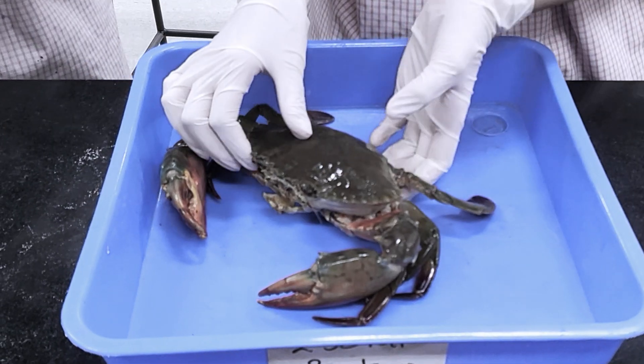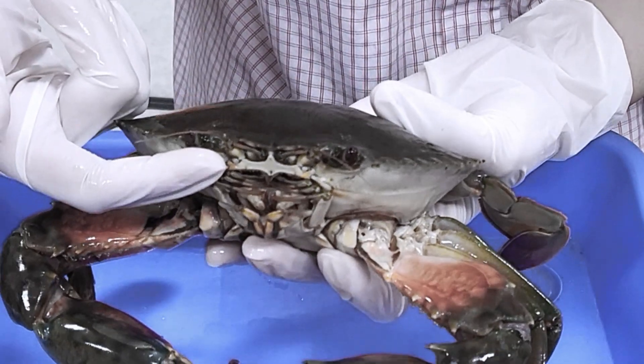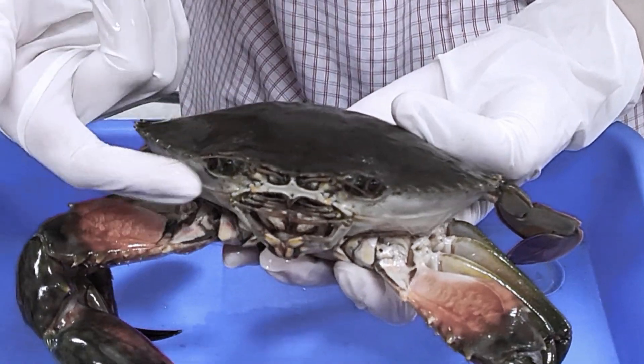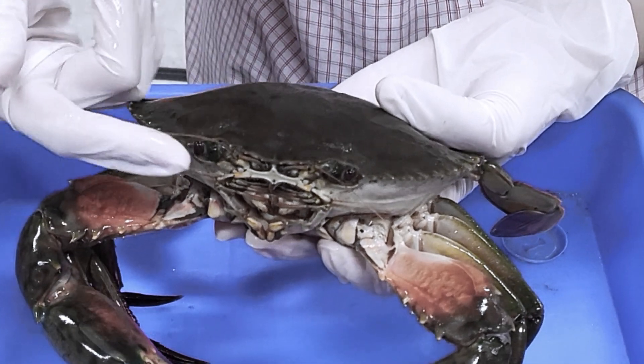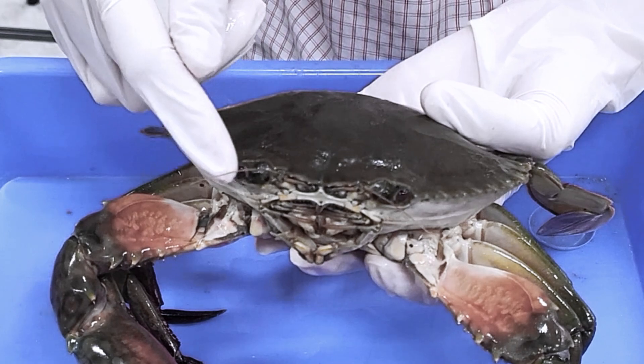Let's observe its face. Its eyes are held in place by short, individually movable, and adjustable eyestalks. They can fold their eyes into shell sockets for protection and see in all directions due to their compound eyes.